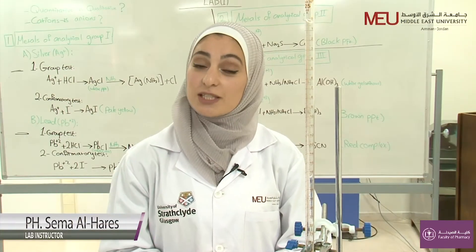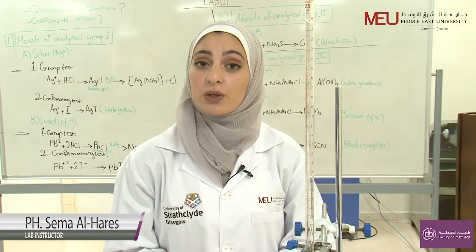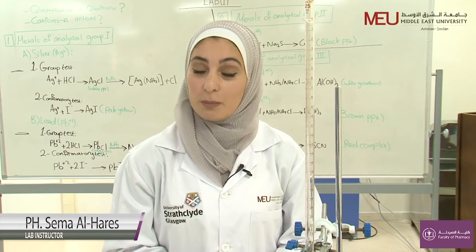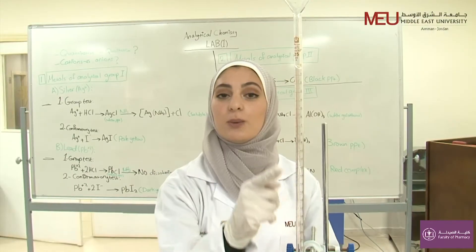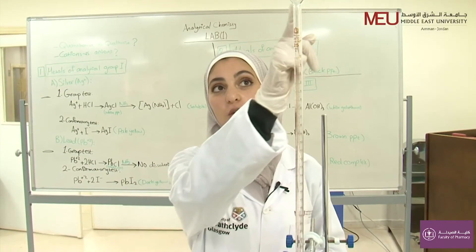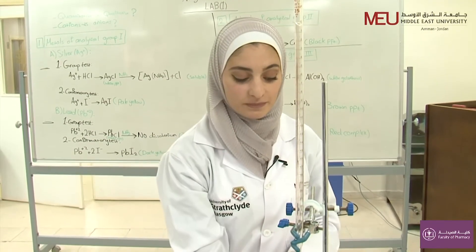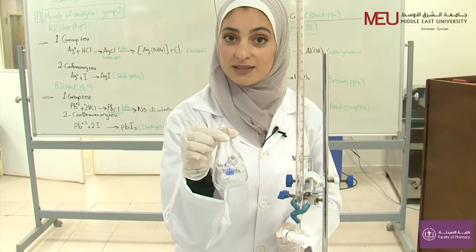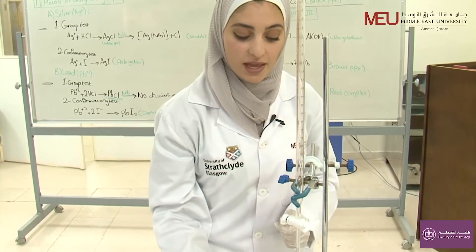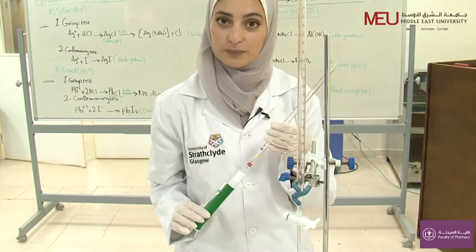Hello everyone! In this video, I'll be showing you how we can perform titration. But before we start, we must know the tools that we will use: burette, funnel, conical flask, and volumetric pipette.